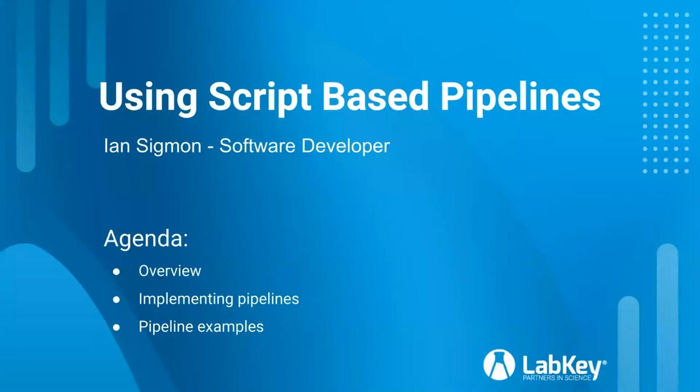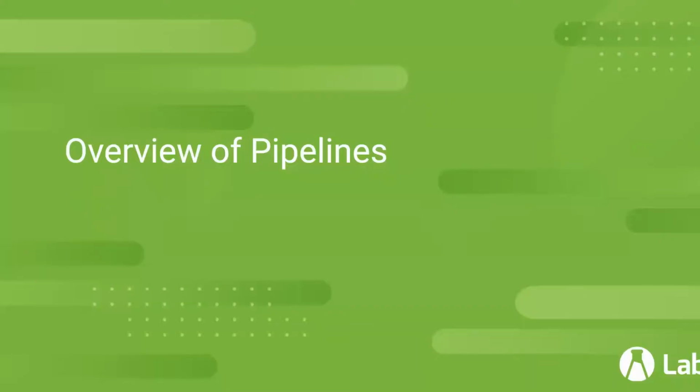I'm Ian Sigmon. I'm a software developer here at LabKey, and I will be talking about how to set up and use the script-based pipelines. So just a quick overview, we're going to talk about a little bit of history of where they came from, and then get into how to implement them, and then a few quick examples of what they look like.